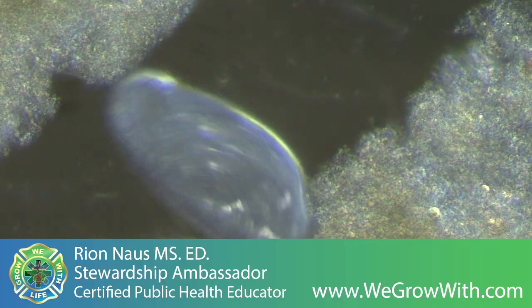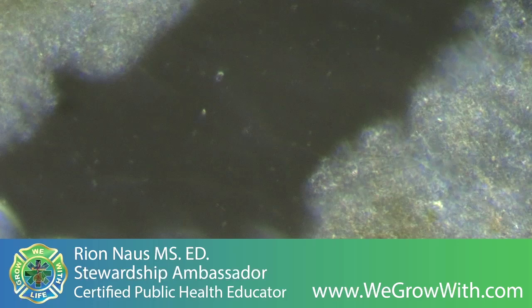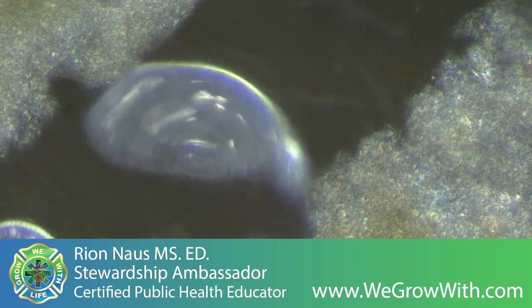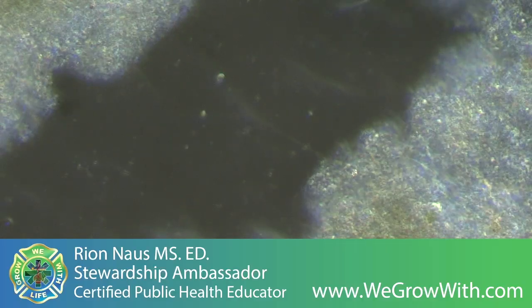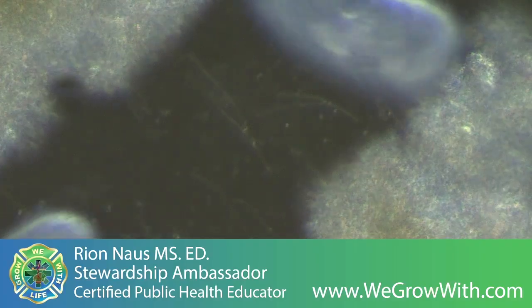When we talk about environmental impact, you can see how just this drying out process, which is natural, drastically changes the microbiome.